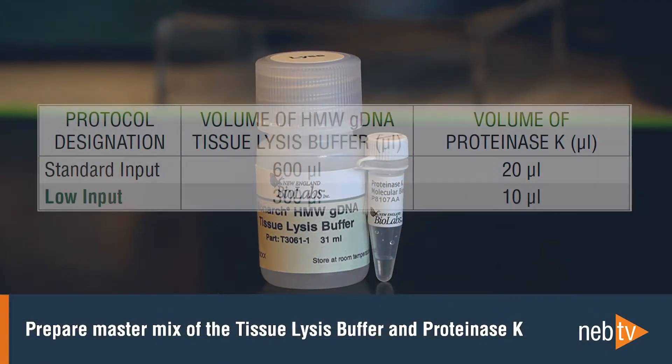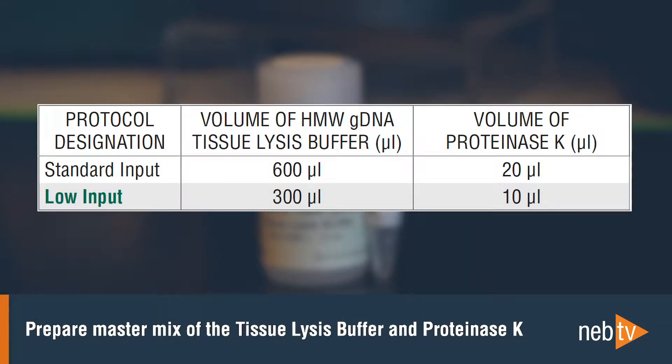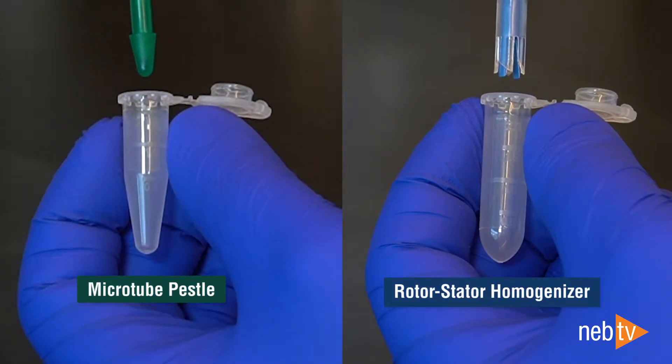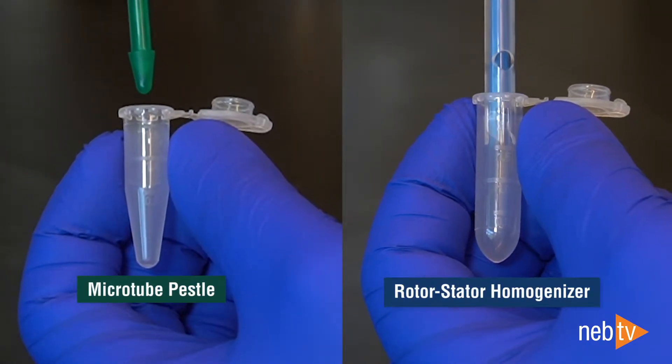First, you will need to prepare a master mix of the tissue lysis buffer and proteinase K. For sample homogenization, you can use either the included Microtube PESL or a rotor-stator homogenizer.